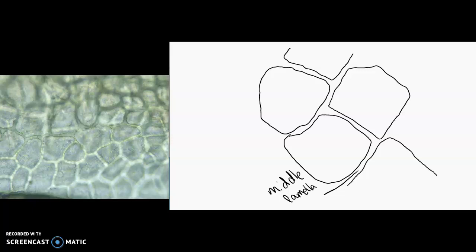And then edging the side of the cell, you have the cell wall there.